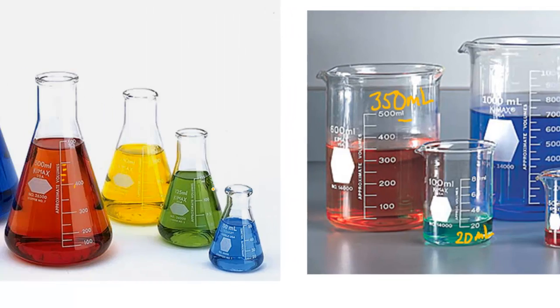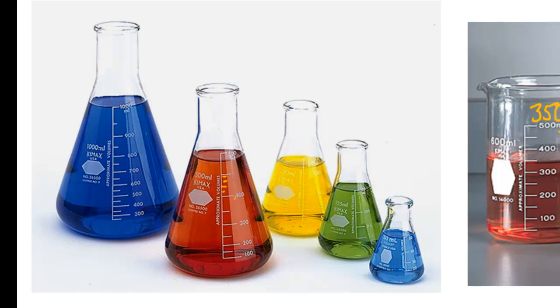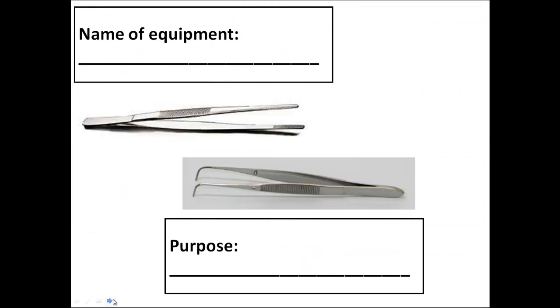That's just about 100. These over here, if you take a look, that looks like it's about 50. It looks like it's about 100. I can't read the yellow. This one looks like they're trying to approach 450, somewhere around 490-ish. But again, it's a gross value. It's not very accurate. If you want to find accuracy, you've got to use a graduated cylinder.